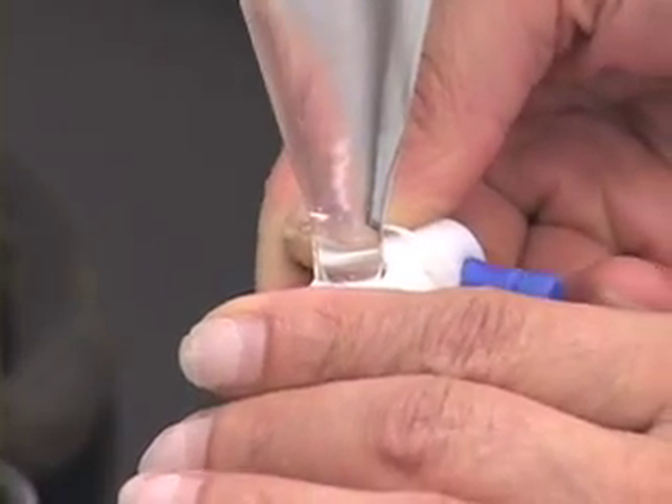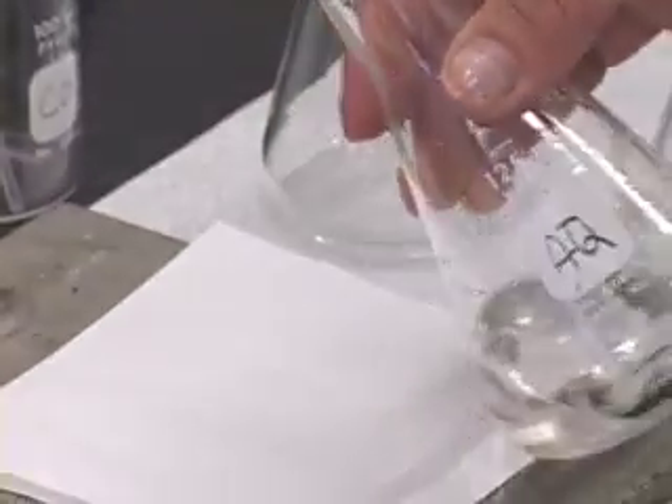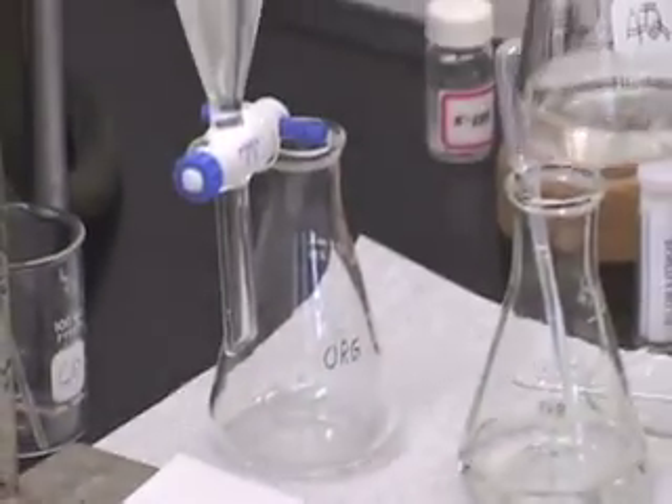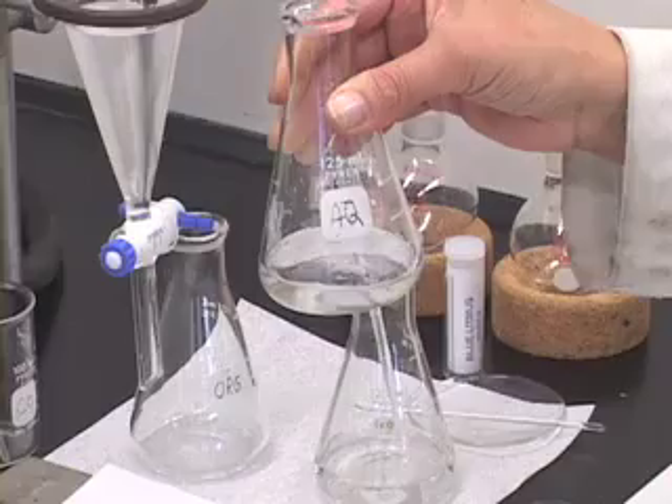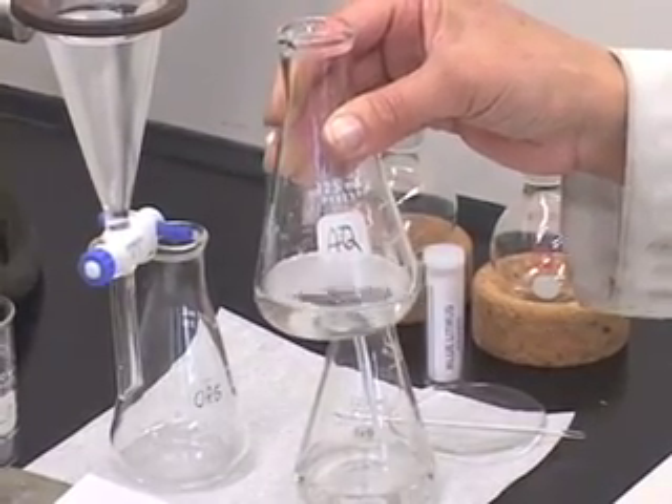This layer labeled aqueous contains the conjugate base of the acid. We are going to work with it a little later, so let us put it aside.